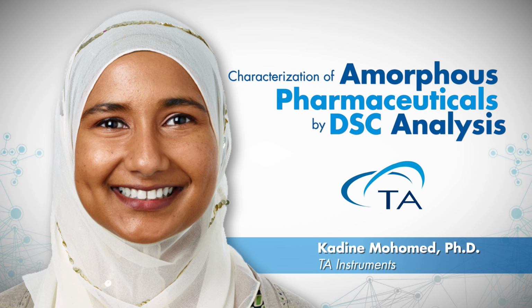Here's a good question, I think, to make sure people understand. Do you add the sample pan at minus 180, or minus 80, or at ambient to start the equilibration? That's a great question. Let's say at room temperature your sample, as you cool it down, is not going to go through any sort of crystallization. Let's say it's a solid at room temperature. Then if you were to place that sample pan into the cell at room temperature and then equilibrate down to minus 80 or minus 90 degrees, your cooling rate as you cool from 25 to minus 80 is not going to impact any of your thermal events, because the sample is not going through any crystallization on cooling.